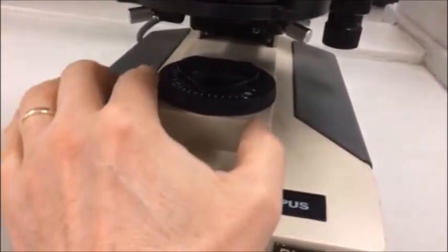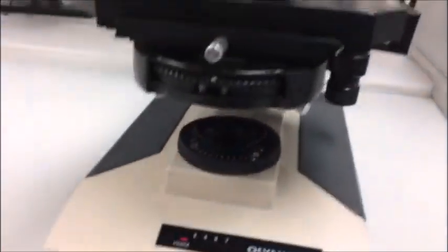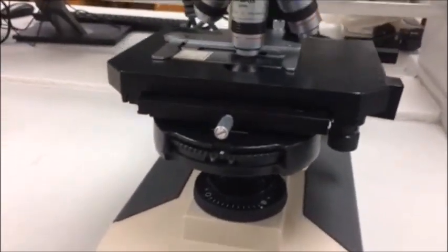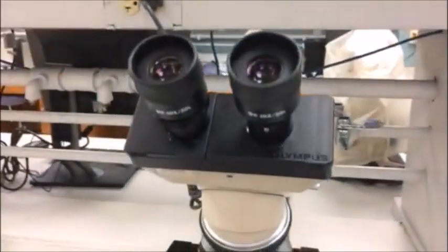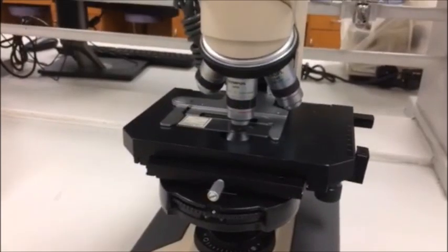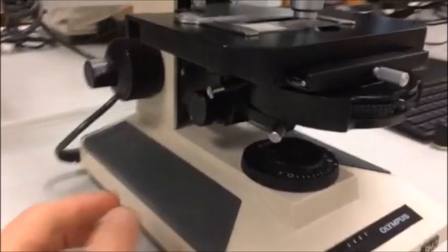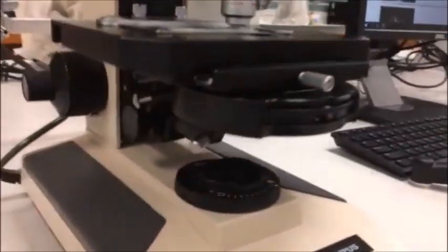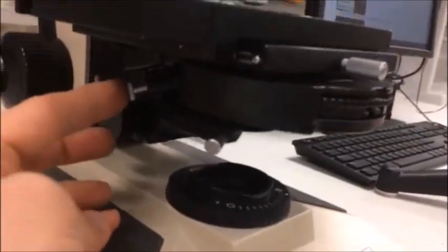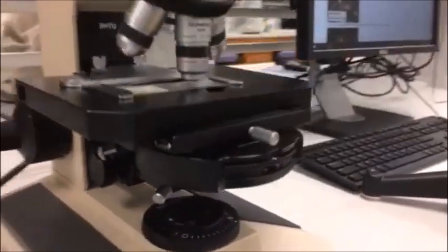And to do that, it's quite simple. All you do is close the field diaphragm all the way counterclockwise, and then look through the eyepiece lens, and if that circle or decagon of light in the middle is not in focus and centered, then you should focus it using the condenser focusing knob and center it using these two little screws here. There are also two screws here in the back. Those, again, are used with phase contrast, so basically we don't mess with those.